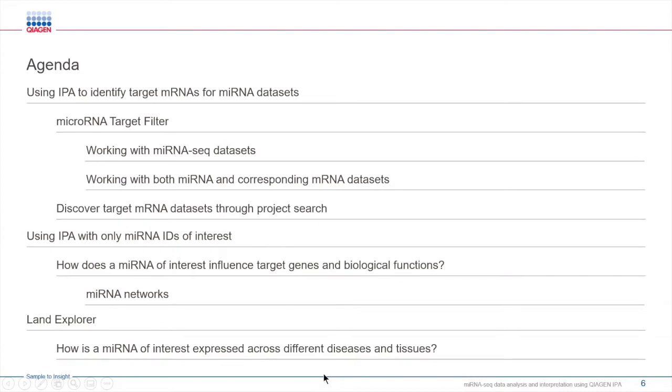Researchers in this field often face many challenges when it comes to the analysis and interpretation of their microRNA data. Today we will see how you can use IPA to overcome some of those challenges.